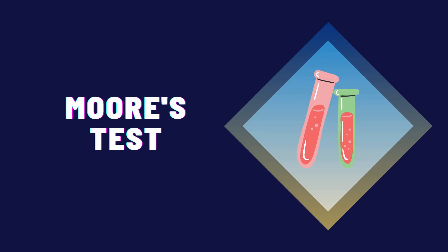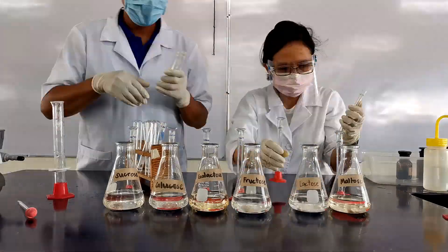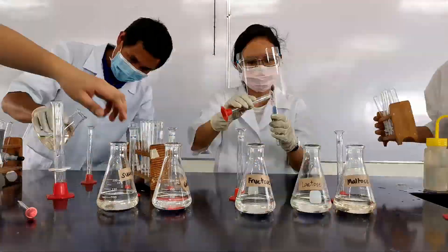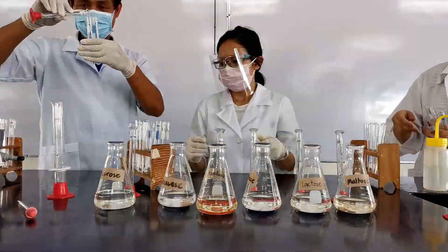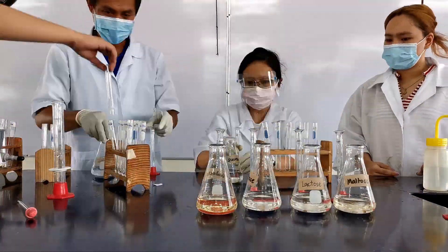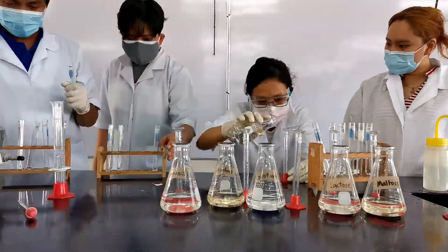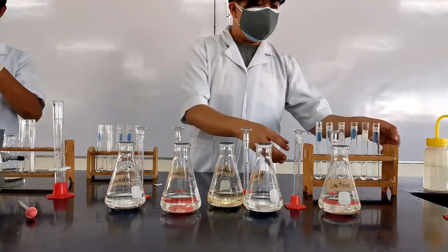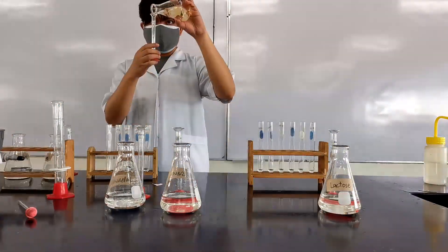Let's start with the Moore's test. Place 1 ml of carbohydrate solution in each test tube. Since we have 6 different carbohydrate solutions, we need 6 test tubes for each test. Use the graduated cylinder to measure small volumes and make sure to label your test tubes using the label tapes and markers.